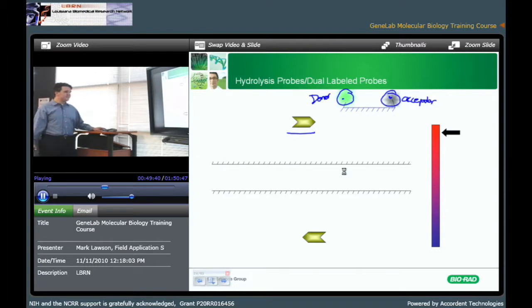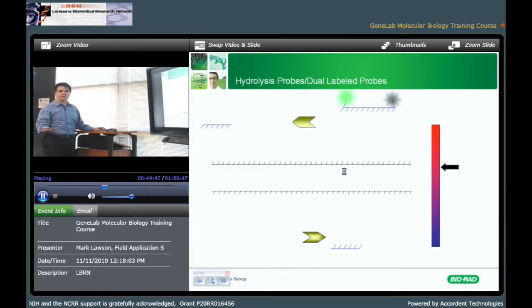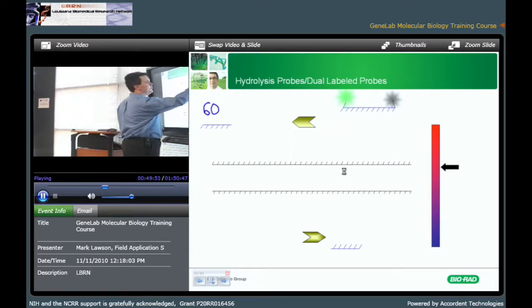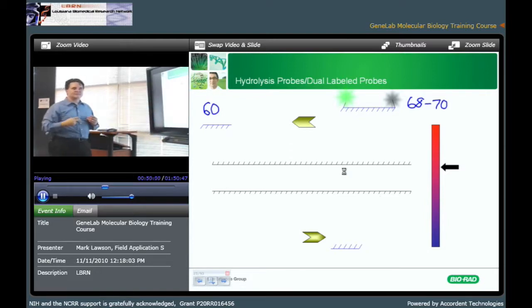Okay, we're up at 95. We've got the probe, and we've got two primers, forward and reverse. Now, the TM of the primers, let's say, is 60. Then the TM of the probe needs to be, I think, 66 to 70. I'm going to say 68 to 70. So it's substantially higher binding affinity. That's because the order of operations here is critical. And this is where most people mess up probe design.